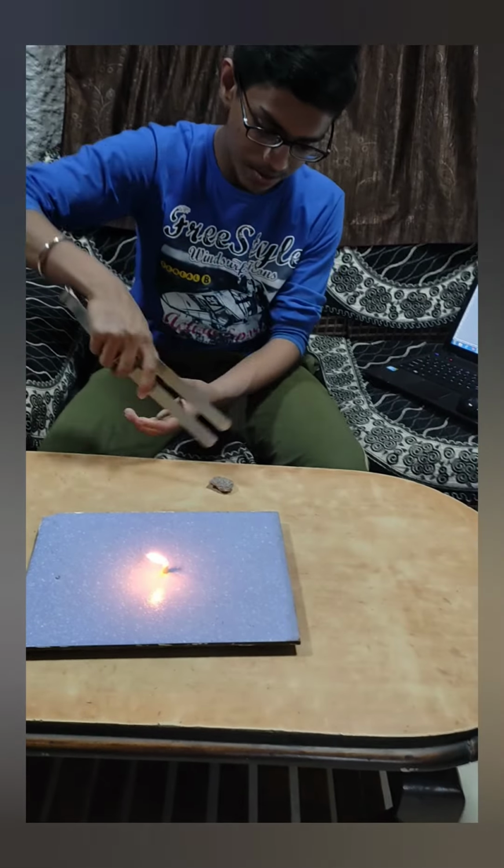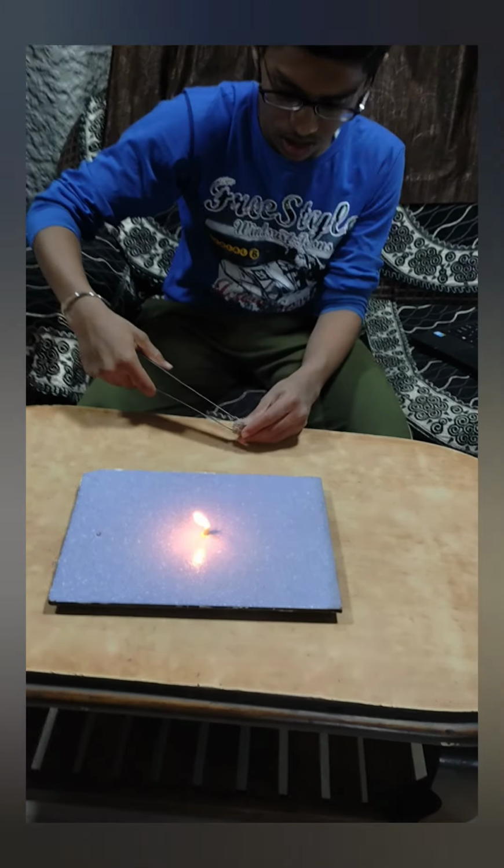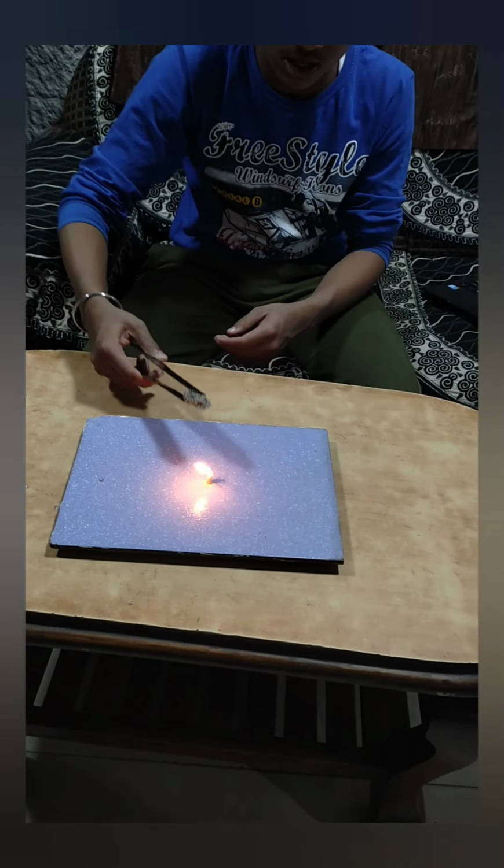Now the fifth item is the stone piece. Now I will burn this stone piece and let's see whether it's a combustible substance or not.